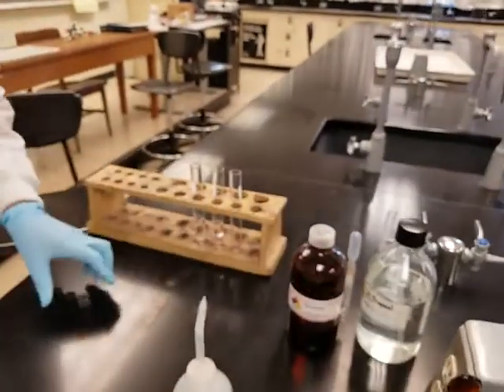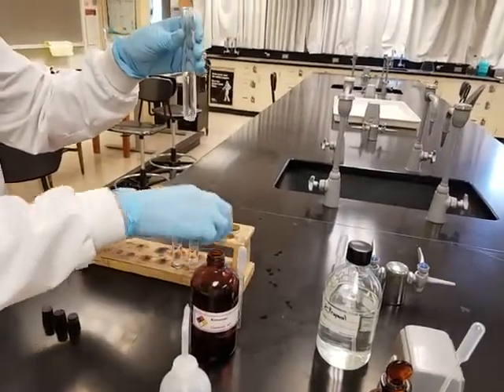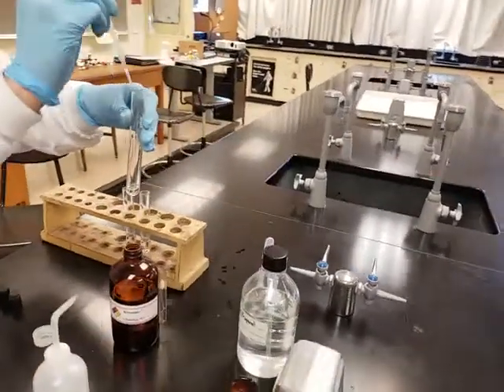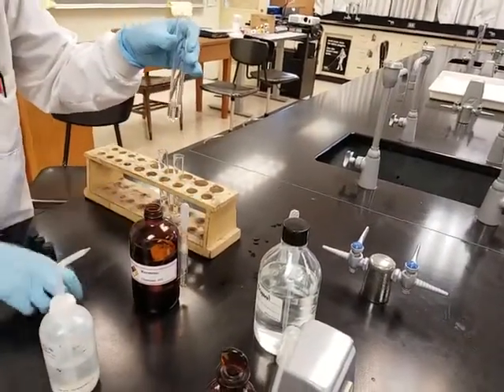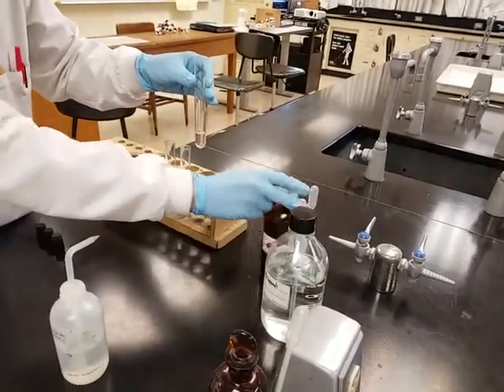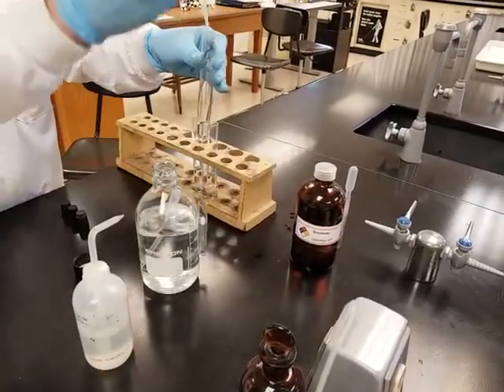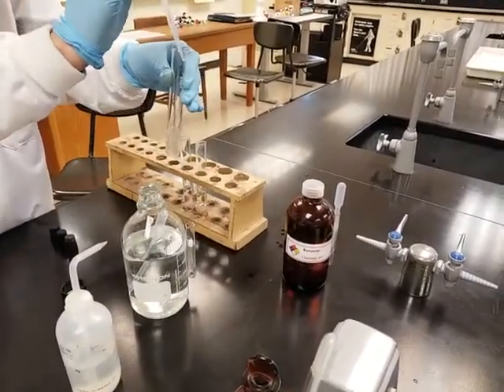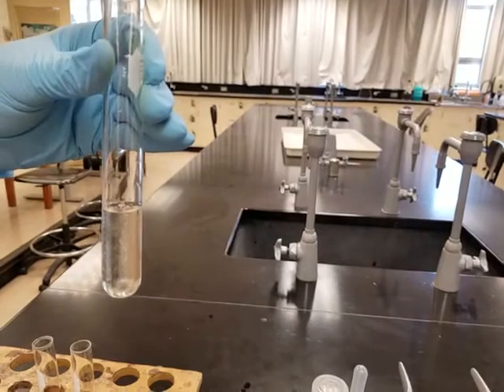And then lastly, we're going to have kerosene and isopropyl alcohol. In this test tube, we're going to put kerosene and isopropyl alcohol, roughly the same amount. So here's some kerosene. This amount of kerosene, and it smells like gasoline. For those of you who love the smell of gasoline, you're going to love this. And then we're going to put some isopropyl alcohol, roughly the same amount. Take a look. This is pre-mixing. I haven't mixed anything yet.